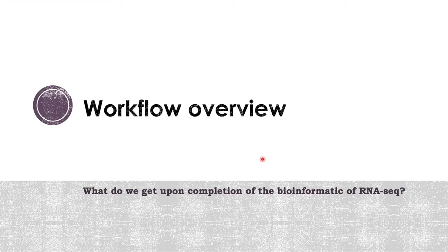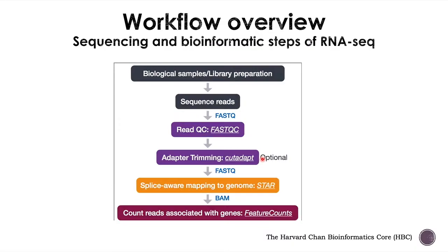So first, let's see a workflow overview. What do you do after completion of the bioinformatic steps of RNA-seq experiments? Here you can see a complete overview of the sequencing and bioinformatic steps of an RNA-seq workflow. It goes from sample collection and library preparation to the sequencing of the isolated RNA. This will give you a series of FASTQ files.